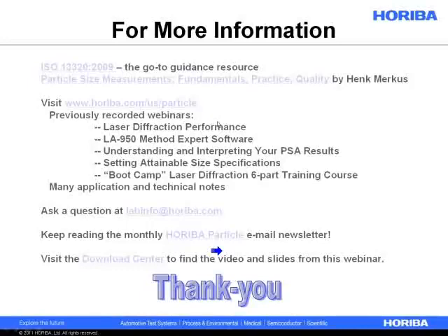So essentially what's happening is, because of better dispersion, they're scattering more light, so your transmitted light is falling, right? More light is being scattered. If it falls far enough, basically if you're creating enough additional particles, it's possible that you'll start to get multiple scattering, and that will affect your data, but it's not terribly likely.